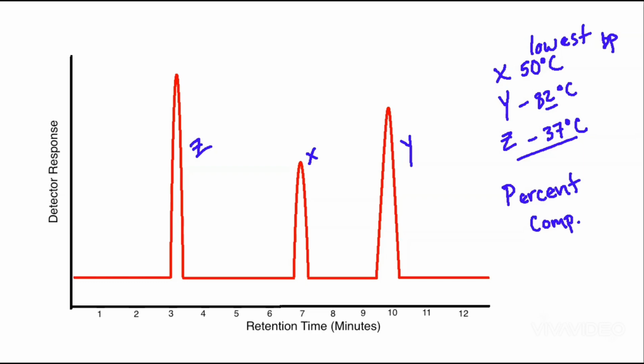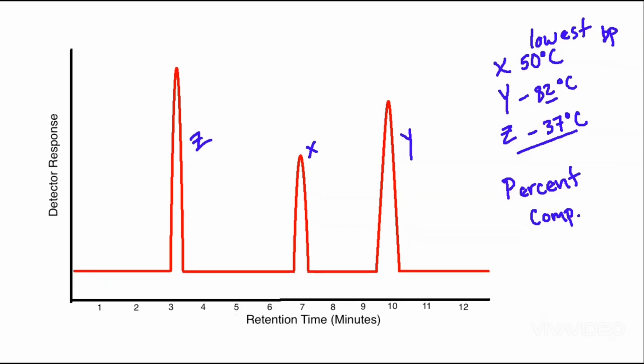It just knows the retention time. So it's your job to match that retention time to the different boiling points, get the correct order, and then you can assess it. All right, so let's take a look here at how we would do this.